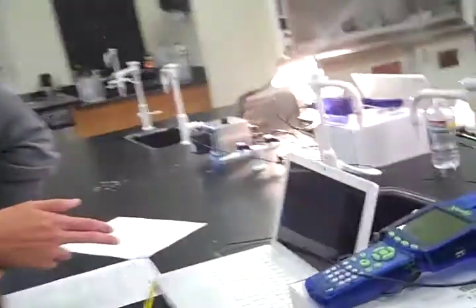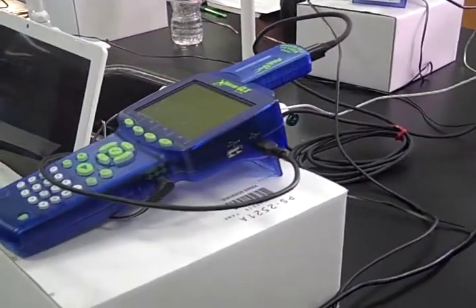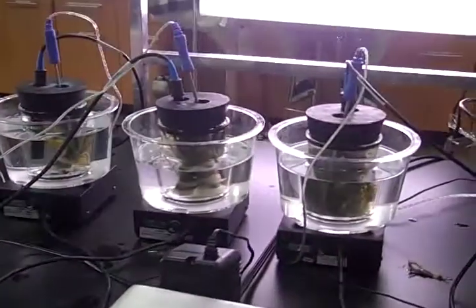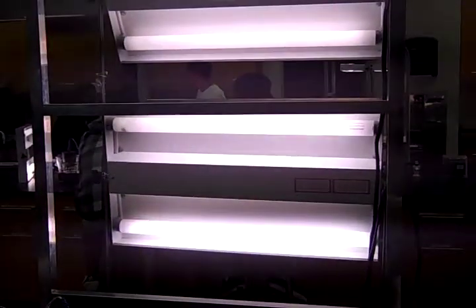Hello. Now, for this experiment, we are going to be monitoring the factors that affect the production of oxygen throughout photosynthesis. To do this, we are currently using a computer, a GLX, a photosynthesis tank, and the sun in the form of a light.